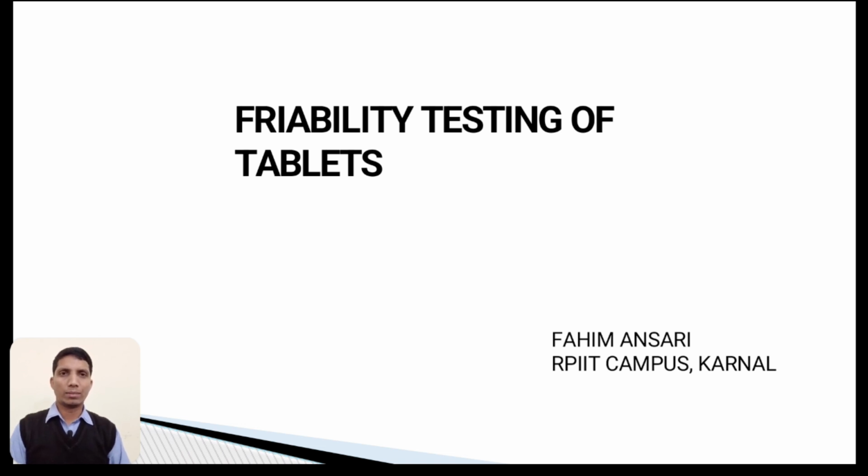Today we will discuss the friability testing of tablets: how the friability testing of tablets is done, on which tablets it is done, what the procedure is, and what the limits and characteristics of the friability testing of tablets are.